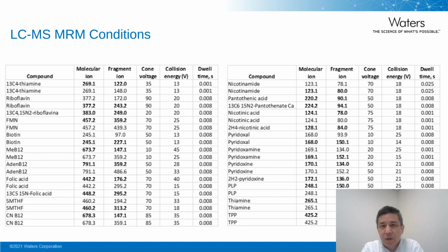This shows the MRM transitions for the B vitamins analysis. The transition in bold is for quantification purposes.